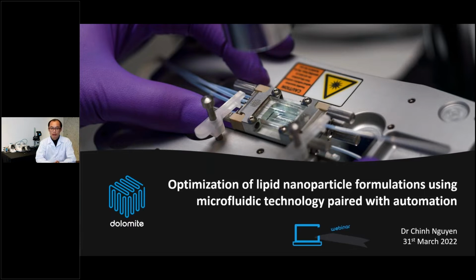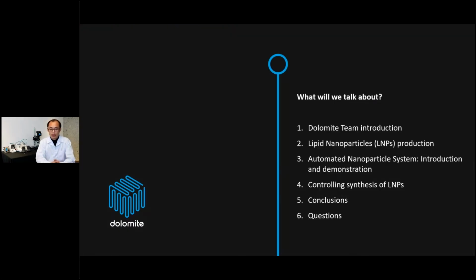So in this webinar, we will be talking about the optimization of lipid nanoparticles formulation using a microfluidic technology paired with automation. The content of today's webinar will include the introduction of the Dolomite team and the introduction about the production of lipid nanoparticles. After that, we move to the introduction and demonstration of the Automated Nanoparticle System and controlled synthesis of lipid nanoparticles. Finally, we move to the conclusion and the Q&A section.